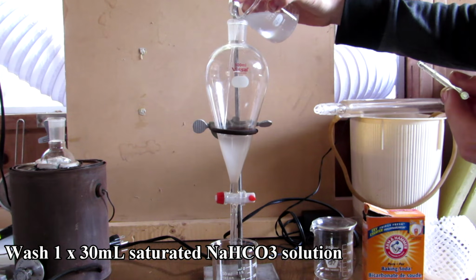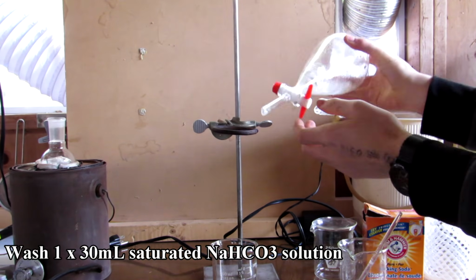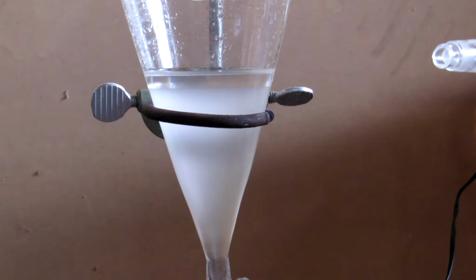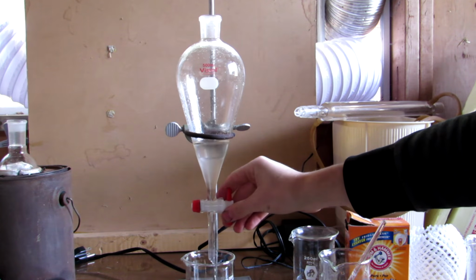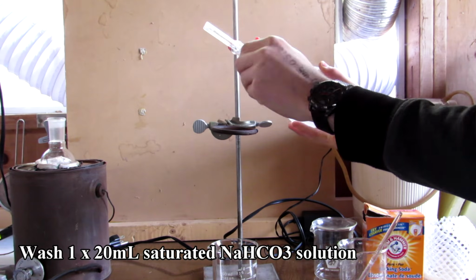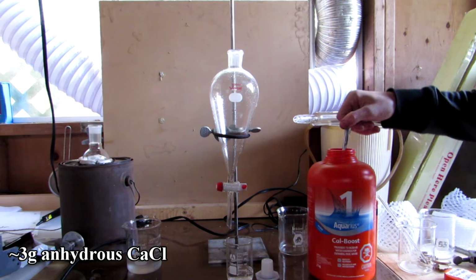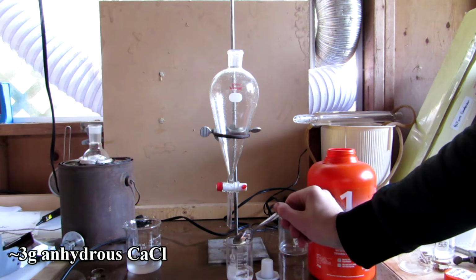Approximately 30 milliliters of the sodium bicarbonate solution was added to the separatory funnel and capped, vented, and shaken to destroy excess acetic acid. Ethanol should also go into the aqueous phase and be removed. The upper ethyl acetate layer was retained and the lower aqueous layer was discarded. The washing step was repeated with another 20 ml of sodium bicarbonate solution, and then anhydrous calcium chloride was used to remove any residual water in the ethyl acetate.